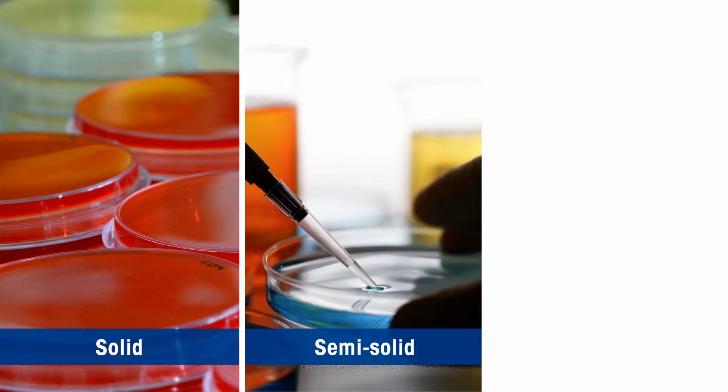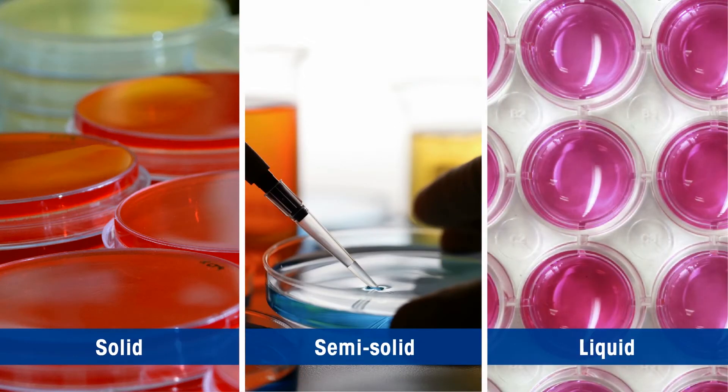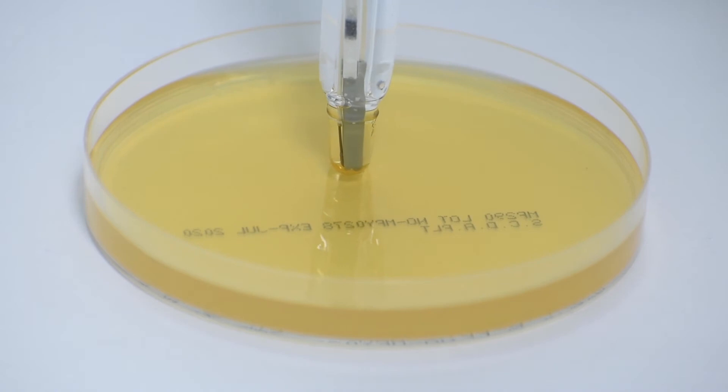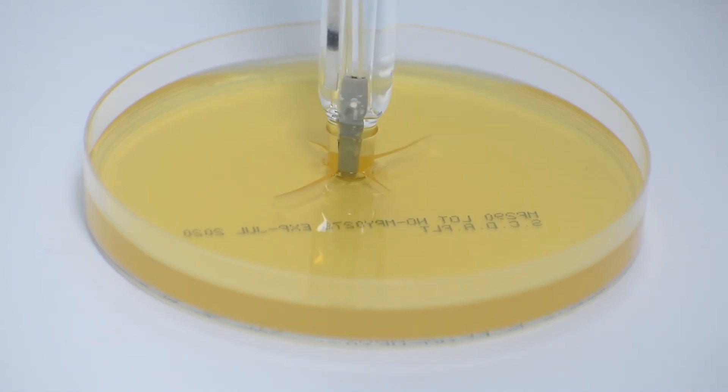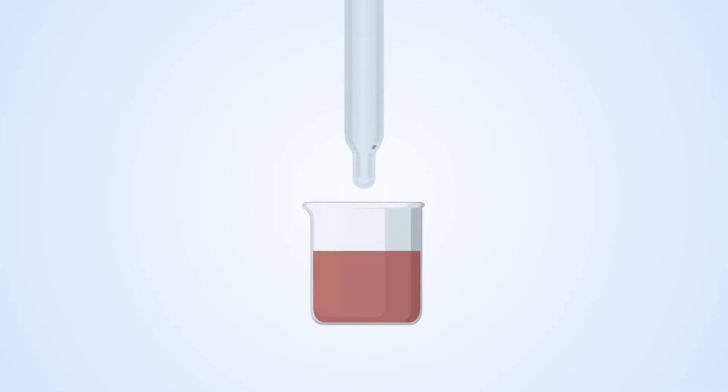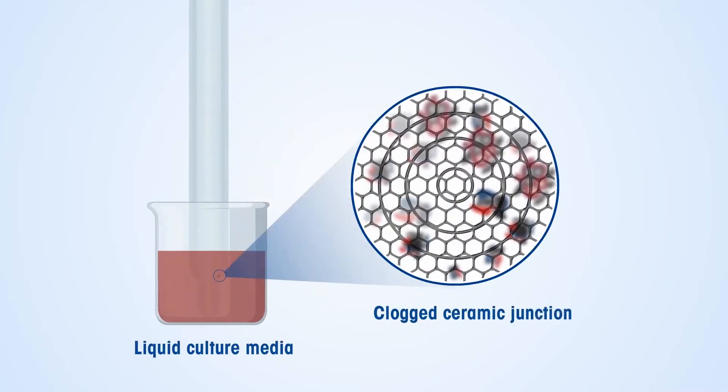Growth media can be solid, semi-solid, or liquid in nature. The different forms of media present different challenges. pH measurement of solid media is difficult with conventional sensors due to its spherical shape, since the reference junction is not in contact with the sample, leading to inaccurate or unstable results.